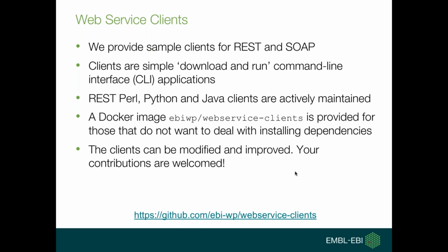Before going for a quick demonstration of how to use the services programmatically, I just want to say that we provide web service clients for both REST and SOAP, although REST, Perl, Python, and Java clients are the ones that we are actively maintaining at the moment. And we provide a Docker image that you can just use, not needing to install Python, Perl, or Java and the dependencies, so that you can run the clients quite easily in that way.